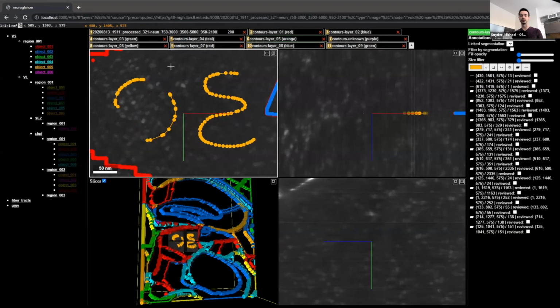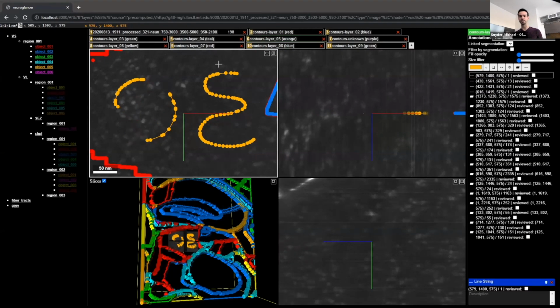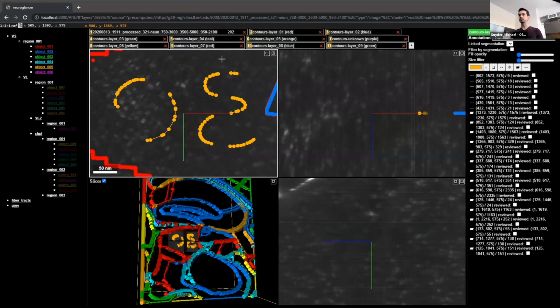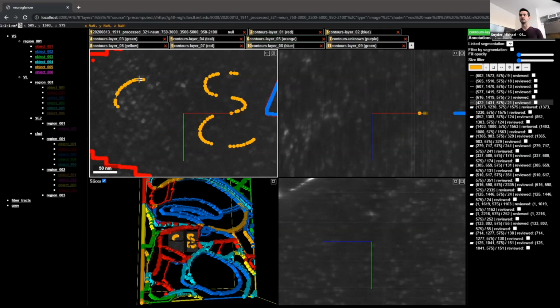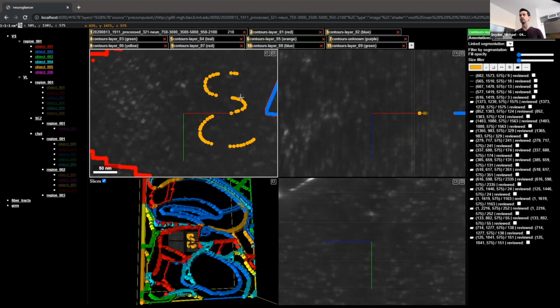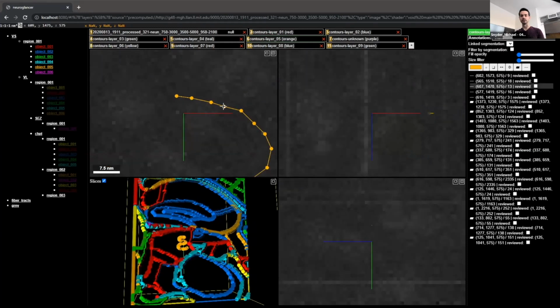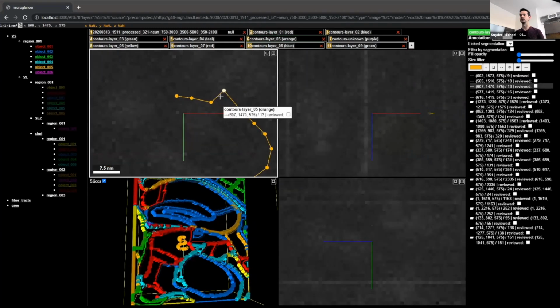So you can draw a region and then use it as a selection region to delete the portion you selected, which is what we're doing here. And then just like baseline NeuroTrALE, you can go through and delete portions that you no longer want to keep, as well as edit sections of existing annotations if you need to course correct something that you yourself did or something that the algorithm auto-detected for you.